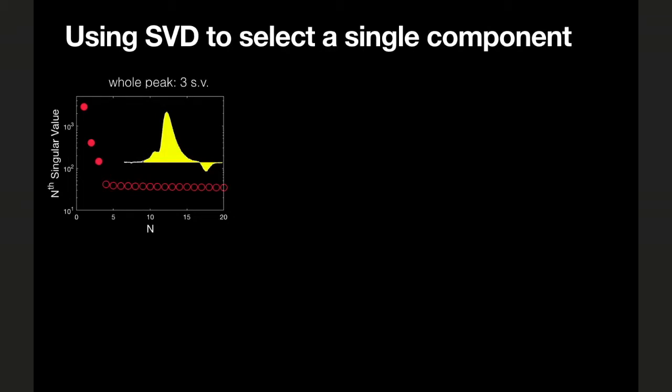Okay. So this should tell you that you can use SVD. Since you can use SVD to detect the number of significant components, you can identify which parts of your chromatogram can be averaged together to get a single scattering curve. And this is just a fun example you can do. For my BSA data here, if I select the whole curve, from the beginning to the end, and I plot the singular values, you can see three significant ones above this noise level.